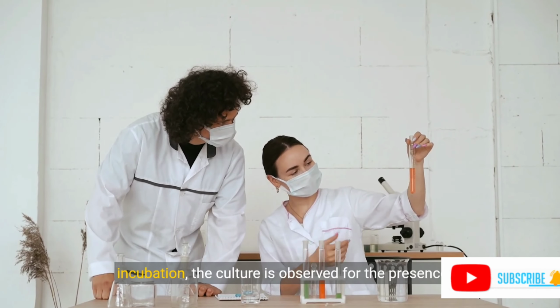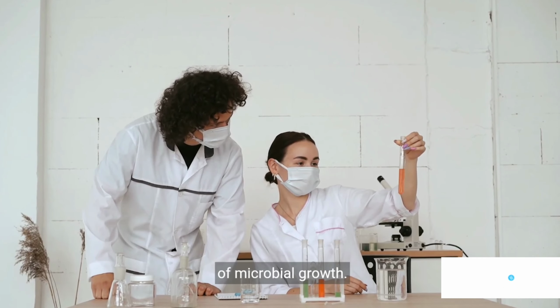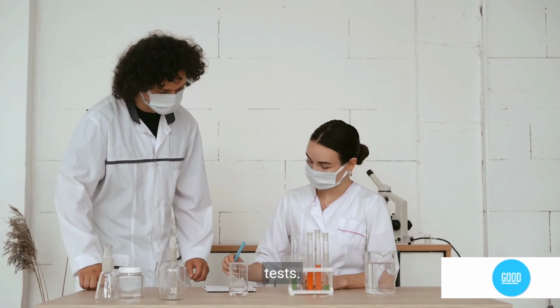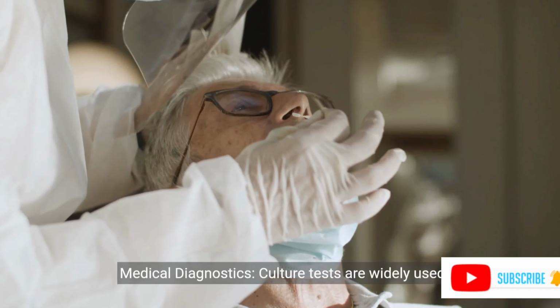After a period of incubation, the culture is observed for the presence of microbial growth. The microorganisms are identified based on their appearance, growth characteristics, and biochemical tests. Applications of culture testing. Medical diagnostics.